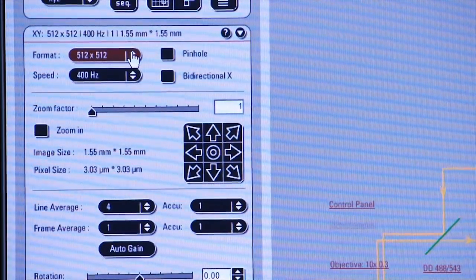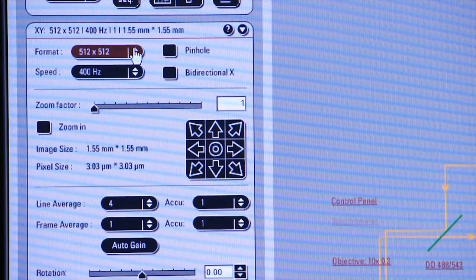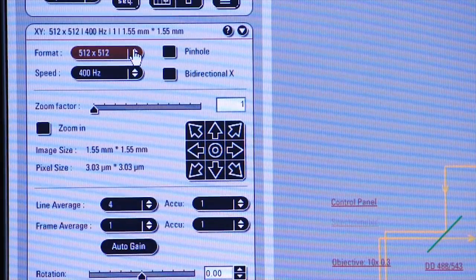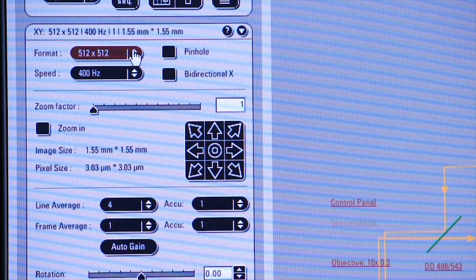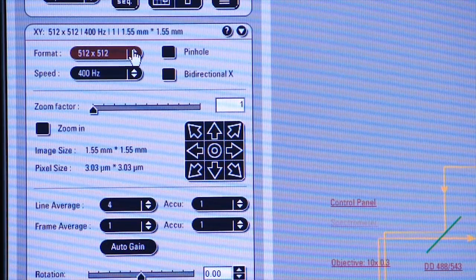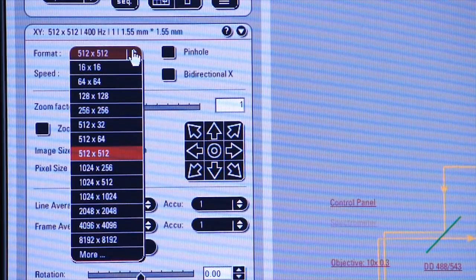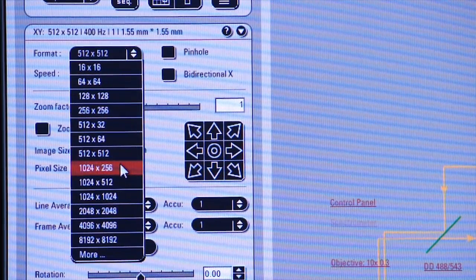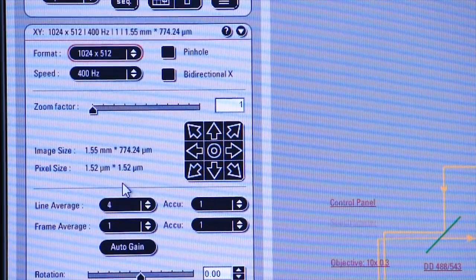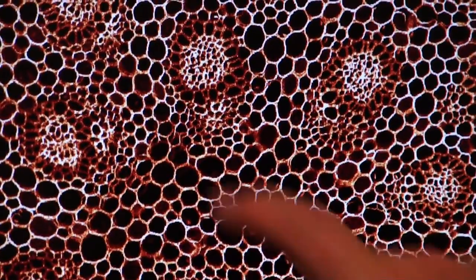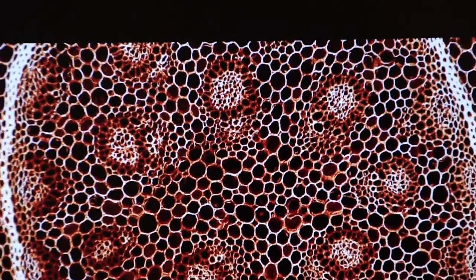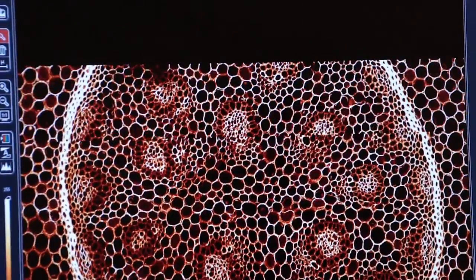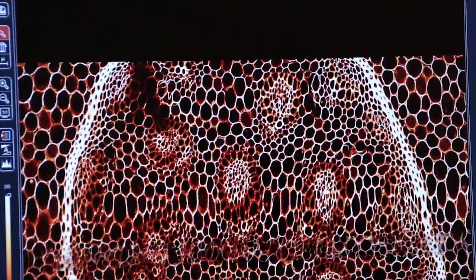One feature that's very useful when I'm using a specimen with a fluorophore that quenches or photobleaches very rapidly, is I can select a narrow, long window of resolution. So if I select 1024 by 512 and I go live, I now see on my resultant image a narrow window of high resolution. This makes it easy for me to reposition my image using the XY stage.